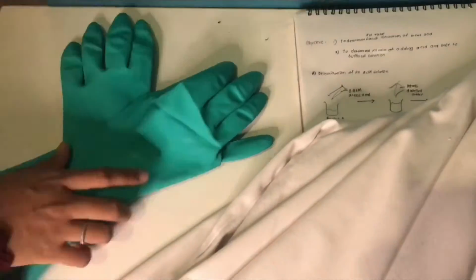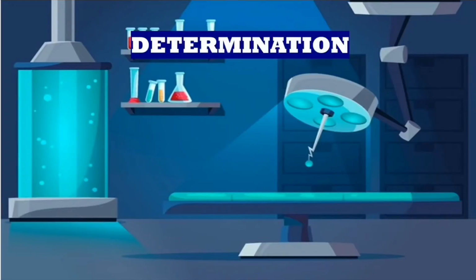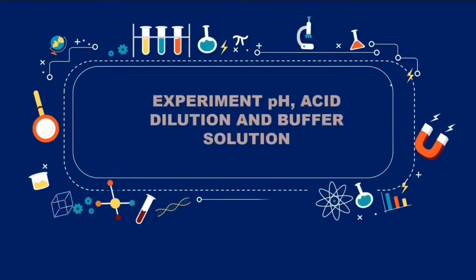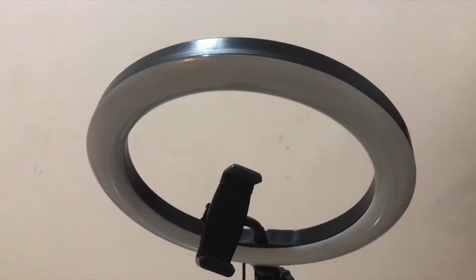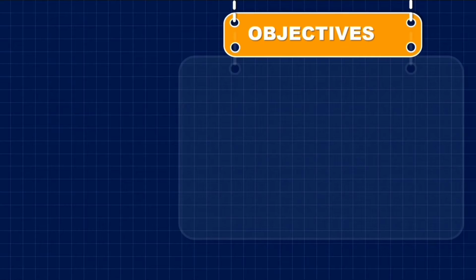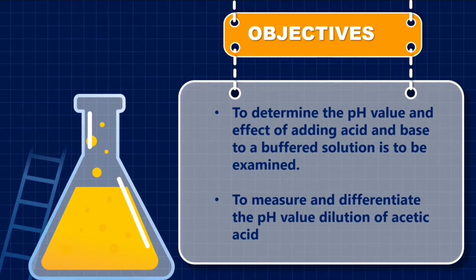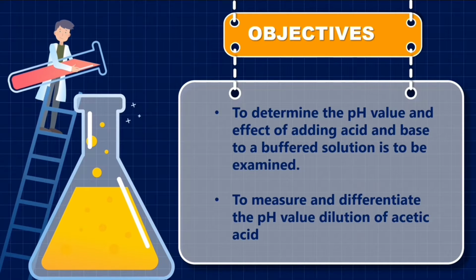Where to begin. The title of this experiment is Determination of pH of Solution. Yes, this is an interesting experiment. Now, let me explain. The objectives are to determine the pH value, to examine the effects of adding acid and base to a buffer solution, and to measure and differentiate the pH value on dilution of acetic acid.